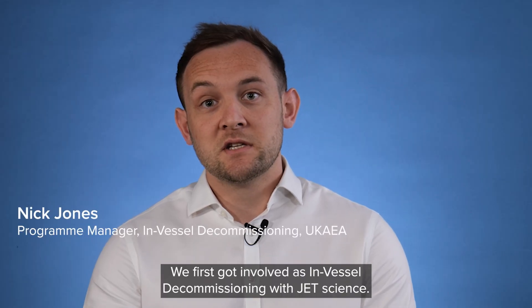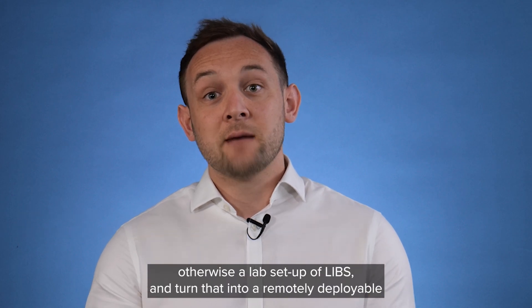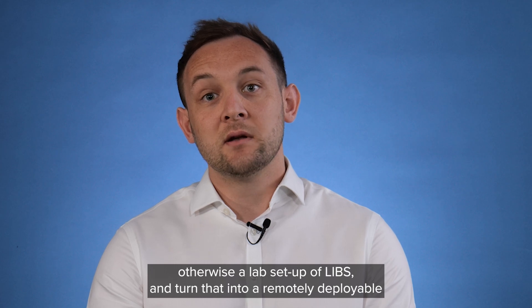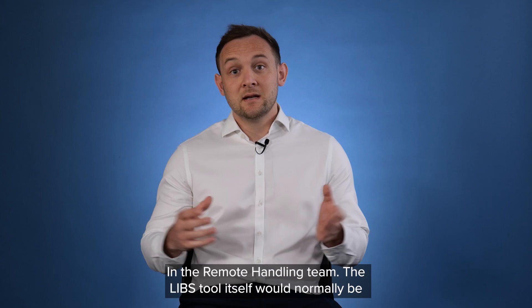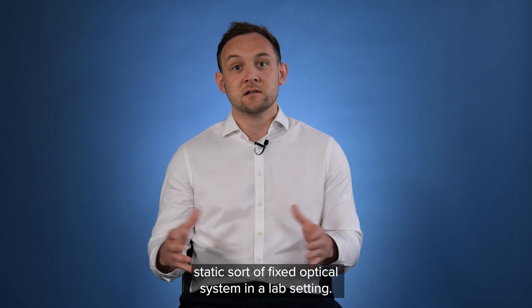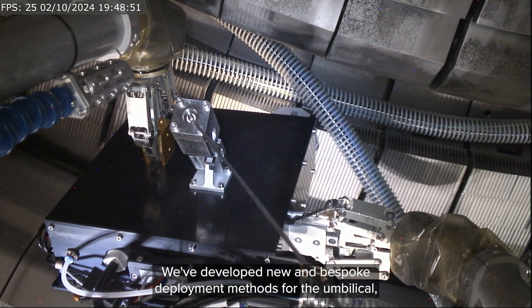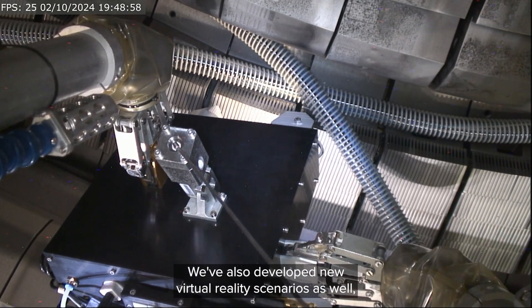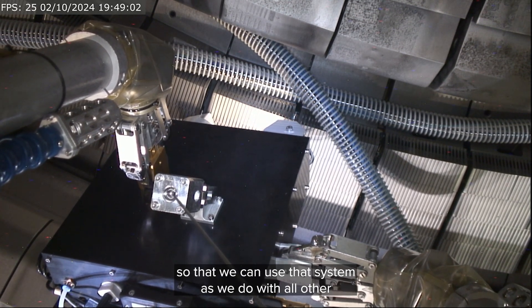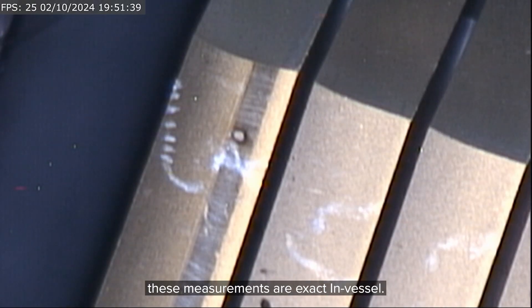We first got involved in in-vessel decommissioning with JET Science when they sought our expertise to take what was otherwise a lab setup of LIBS and turn it into a remotely deployable and operational system — which is what we've done for many decades here in the remote handling team. The LIBS tool itself would normally be a static, fixed optical system in a lab setting. We've taken that and packaged it into a tool which can be handled by the MASCOT system. We've developed new and bespoke deployment methods for the umbilical, coming from a clean area in vessel, and also developed new virtual reality scenarios to ensure that the locations we're taking these measurements are exact in vessel.